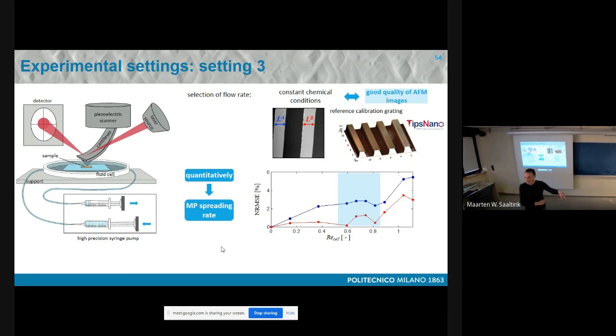Anyway, I have two sets of questions, and all of them involve your team. The first one I thought I would not ask. When you showed the first image, I thought this is crazy, you have to do it with tiny differences. But then I realized that in light interferometry the wavelength applied is several hundred nanometers, so you could not go beyond a resolution of 1 micron. Okay, so forget it.